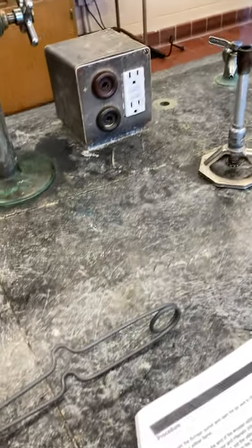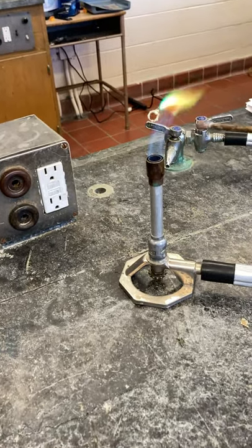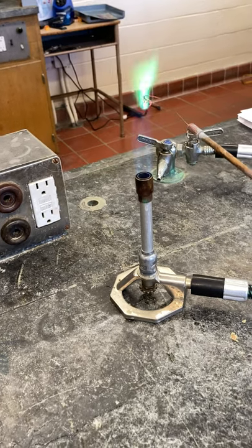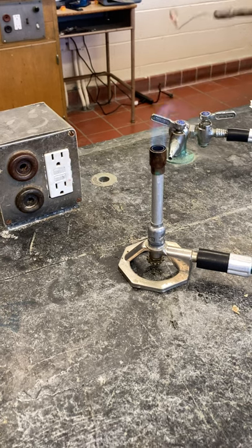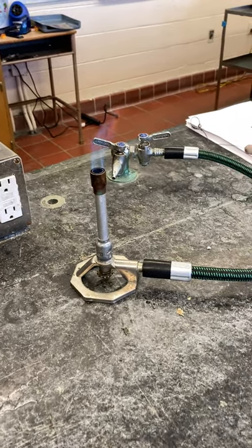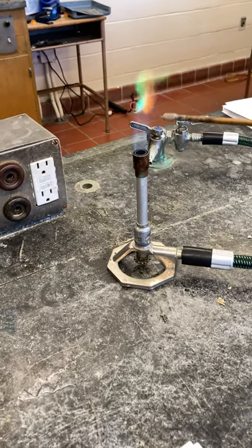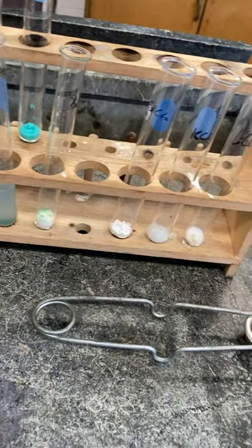And flame. So this one's orange. It was orange at the beginning. So what are we doing? Maybe do the farther one away. There's wind in this room. I think the wind is bubbly. Wave it right next to the bottom one. Do it again. No, it's fine.